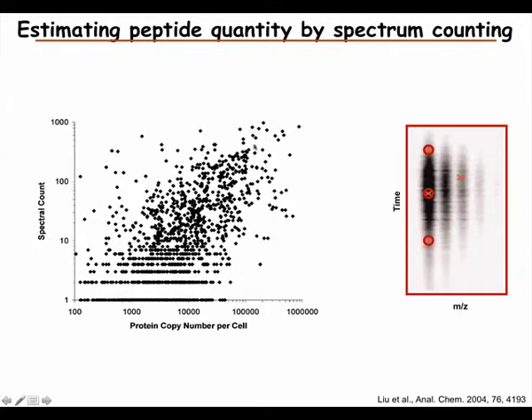And the correlation becomes even better if we compare the spectral count for the same protein in different samples.